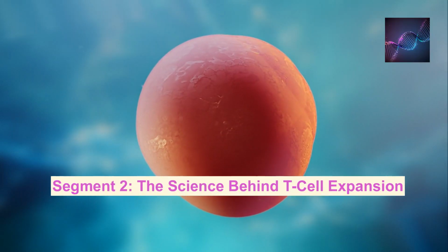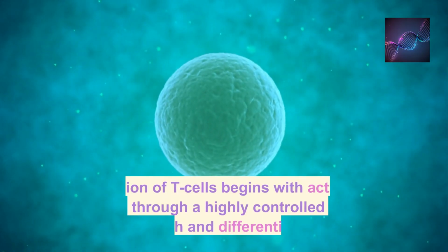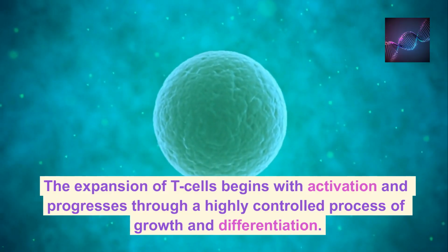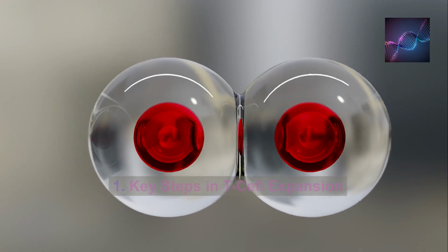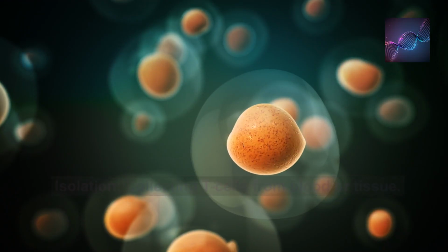Segment 2. The science behind T-cell expansion. The expansion of T-cells begins with activation and progresses through a highly controlled process of growth and differentiation. Key steps in T-cell expansion: isolation, collecting T-cells from blood or tissue.